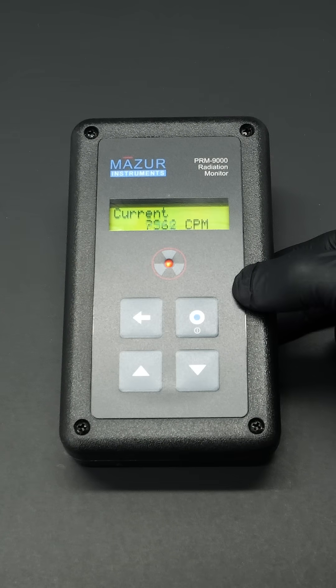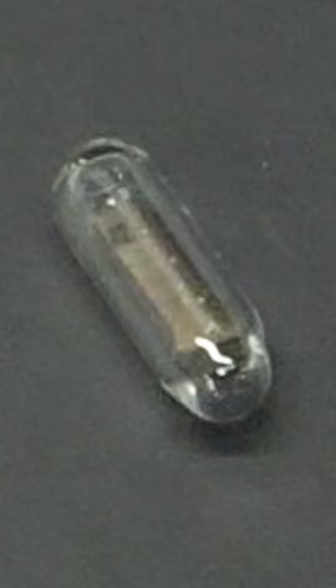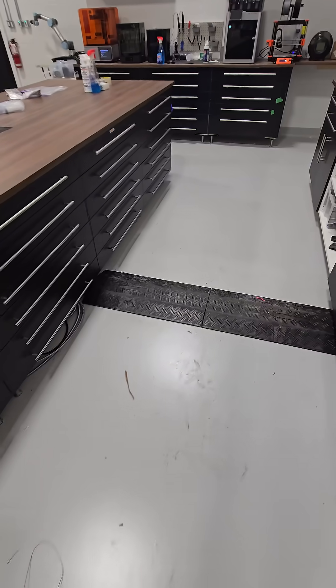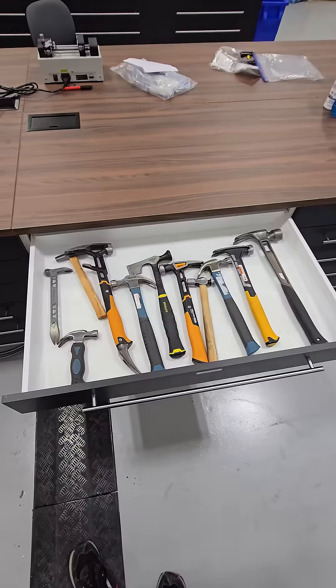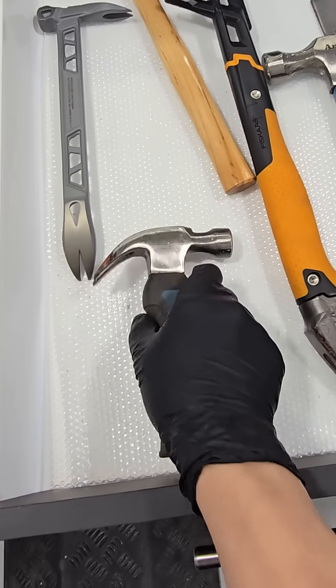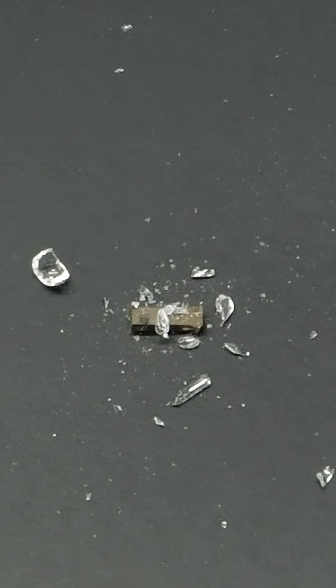The only sad part is that the majority of its radioactivity is being blocked by the glass ampule, and for a while I've been wanting to unleash it. Today is the day, so I go over to my hammer drawer, pick out a nice hammer, and with a couple of gentle taps it is now free.